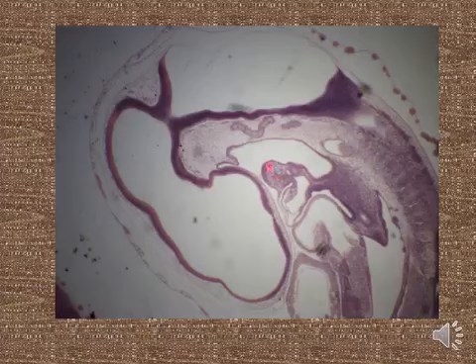You can see the stomodeum, and this is the tissue block of the pharyngeal arch. Ventral to the gut tube is the heart. The heart tube consists of four parts, from anterior to posterior: the bulbus cordis, ventricle, atrium, and the sinus venosus, though not every part is clear in these sections. You can see many parts of the heart loop: bulbus cordis, ventricle, and atrium with sinus venosus, all forming the heart loop.